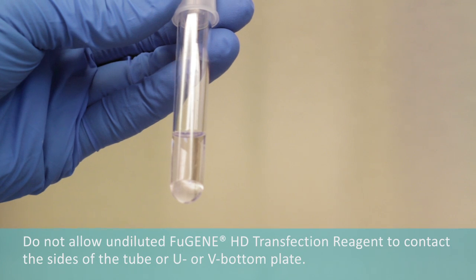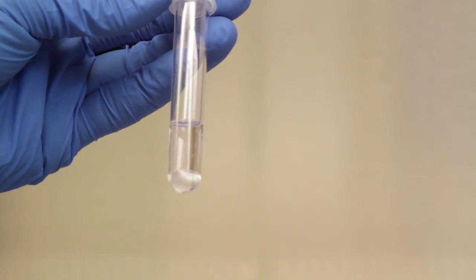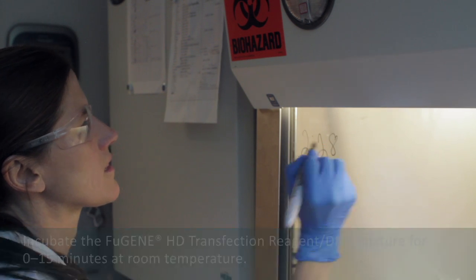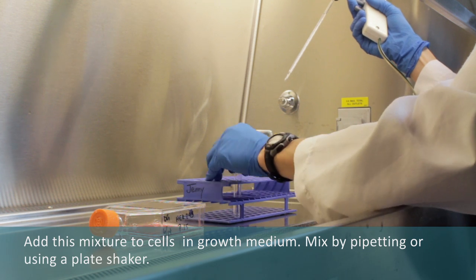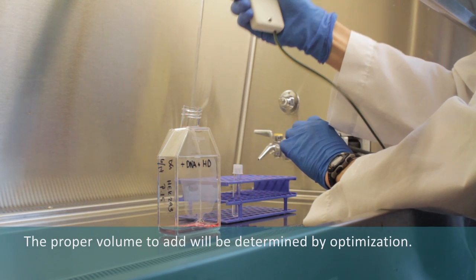Do not allow undiluted Fugene HD transfection reagent to contact the sides of the tube or U- or V-bottom plate. Incubate the Fugene HD transfection reagent and DNA mixture for 0 to 15 minutes at room temperature. Add this mixture to cells in growth medium. Mix by pipetting or using a plate shaker. The proper volume to add will be determined by optimization.